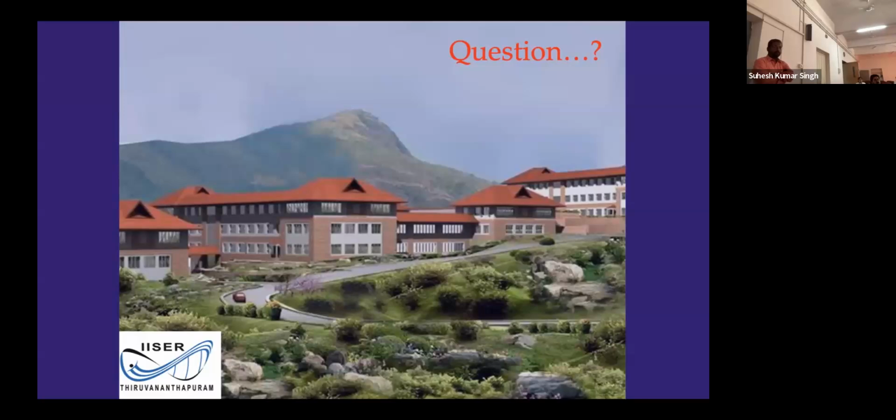And then AR-PAM gives a resolution of say 15 to 20 micrometers. We got around 30 micrometers, but the penetration depth is sadly only 4 to 5 millimeters. And then for tomography, the best possible is the whole mouse, that is 200 micrometers, and the penetration depth is of the order of a few centimeters.